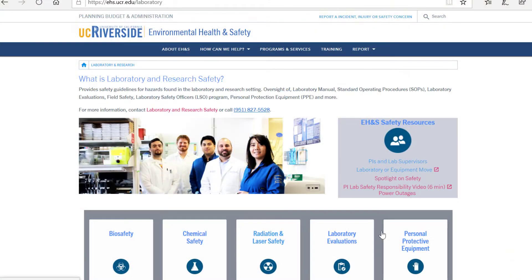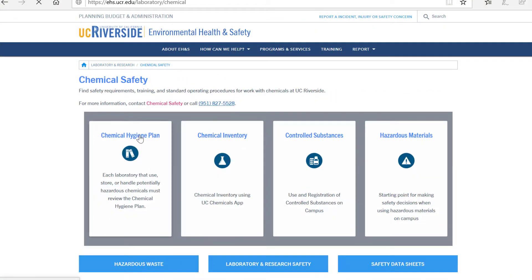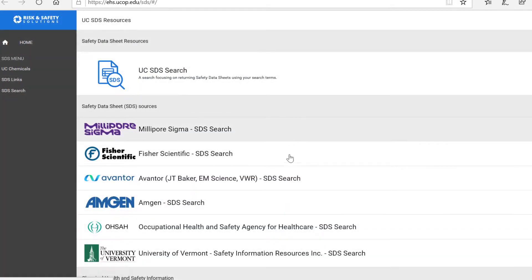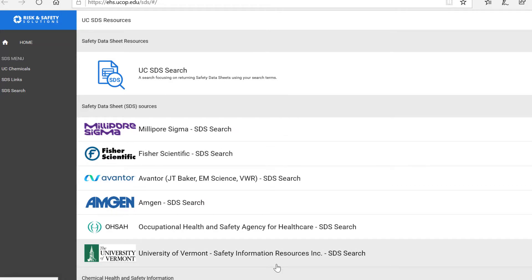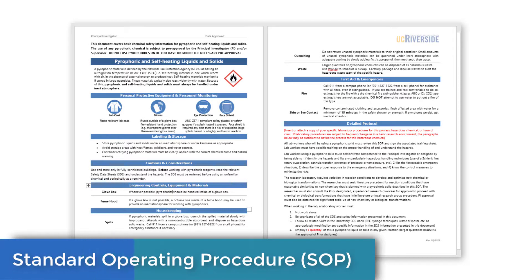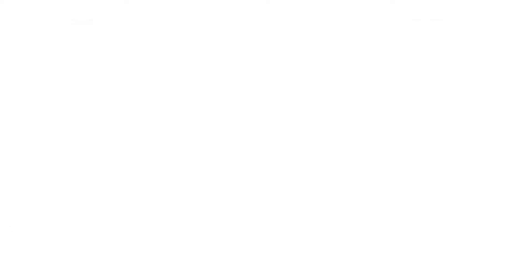If you are working with hazardous materials, you should be familiar with the campus chemical hygiene plan and safety data sheets, or SDSs, of any chemical you're working with. You should also have a specific standard operating procedure, SOP, for working with that material. Be prepared.